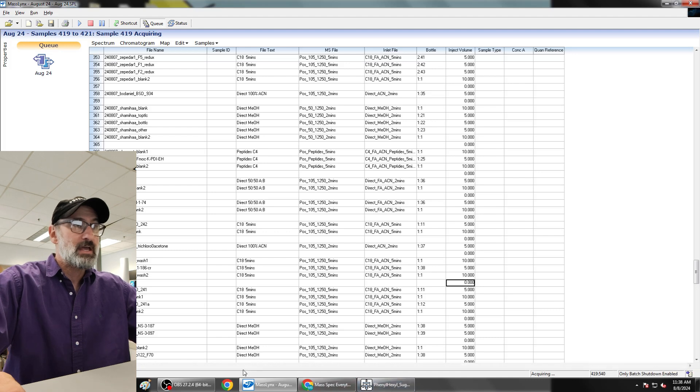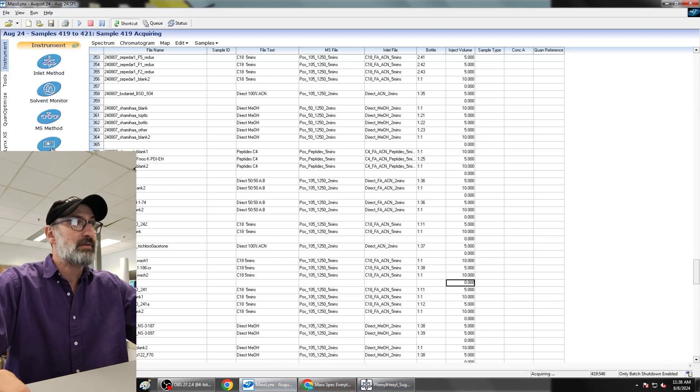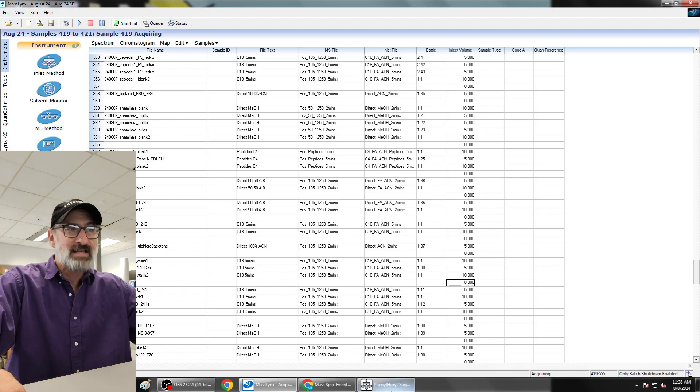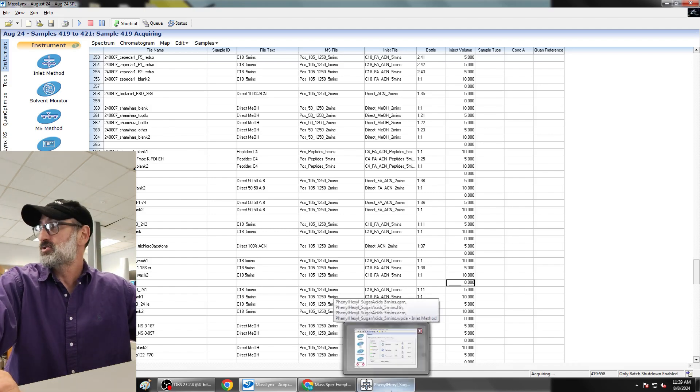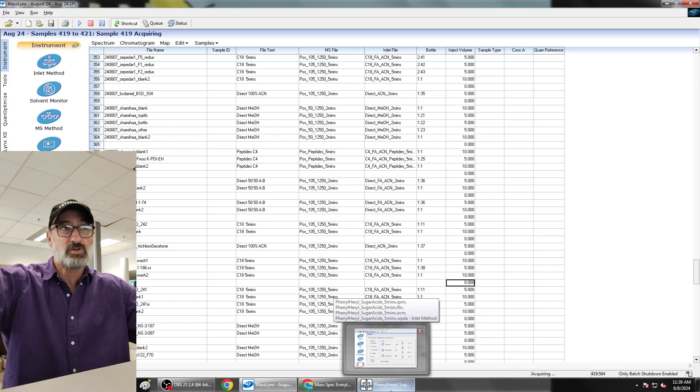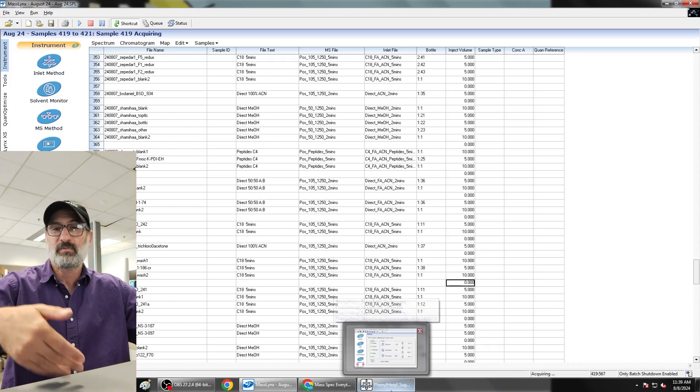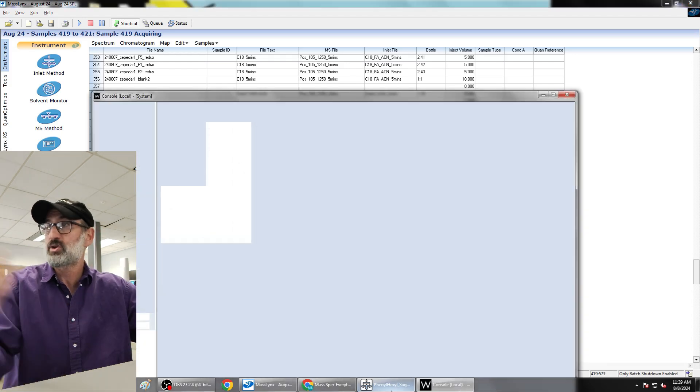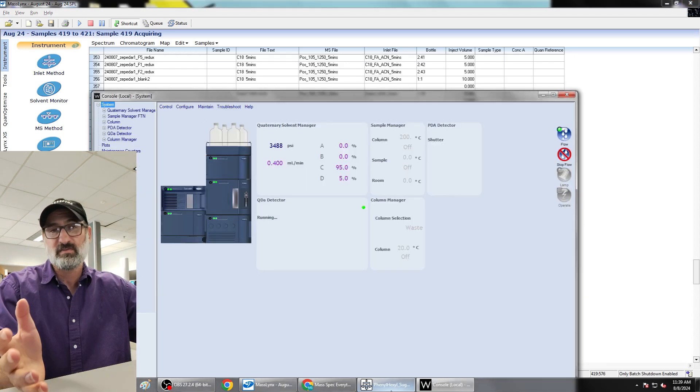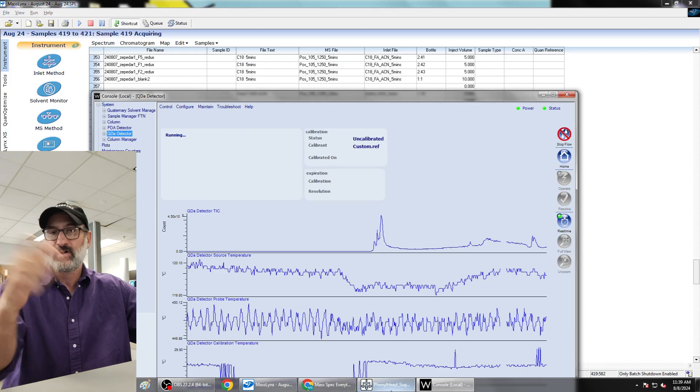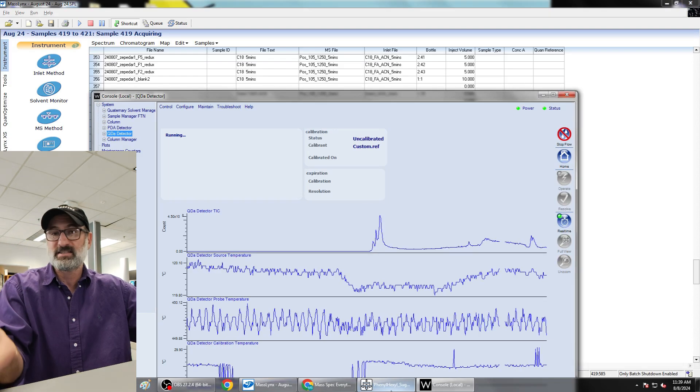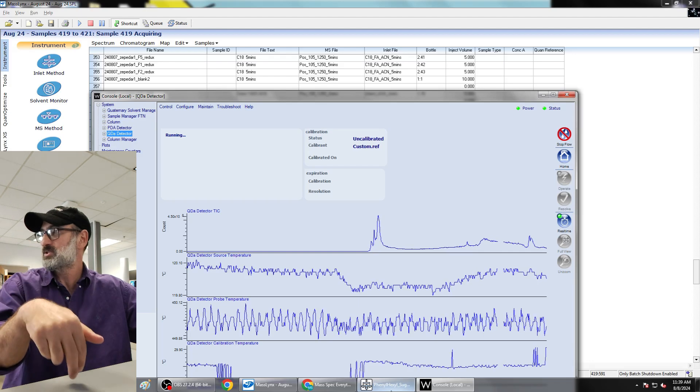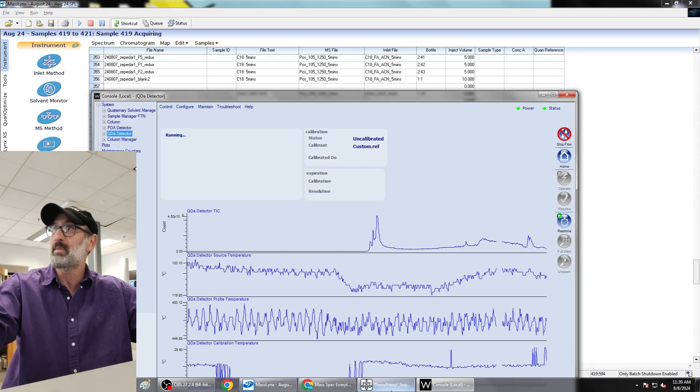The problem with this QDA is that it doesn't have a true divert valve. So you'll notice you get this error all the time. If the gas dies, like if you run out of nitrogen gas to the QDA mass spectrometer, it will put a stop flow on your pumps, and that's to protect itself from getting flooded because there's no real valve. On a real expensive mass spectrometer you have a divert valve. So if it kills the gas, instead of your source getting flooded, it just flips the valve to the waste position and then you can run to waste.